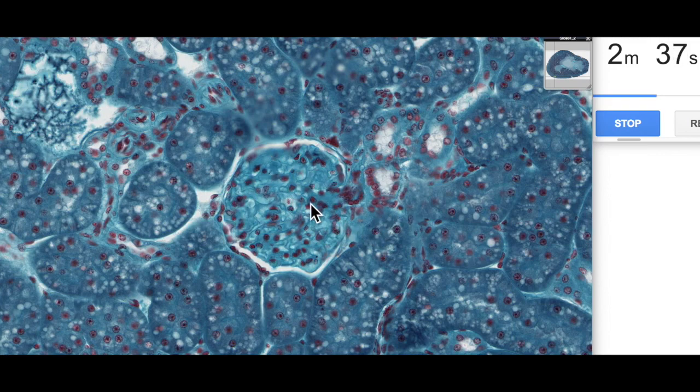The renal corpuscle is made up of two components. It's made up of a capillary tuft known as the glomerulus, which are these loops here which you can see. The endothelial cells have their nuclei here. These are fenestrated capillaries, and that's part of the glomerular filtration barrier.